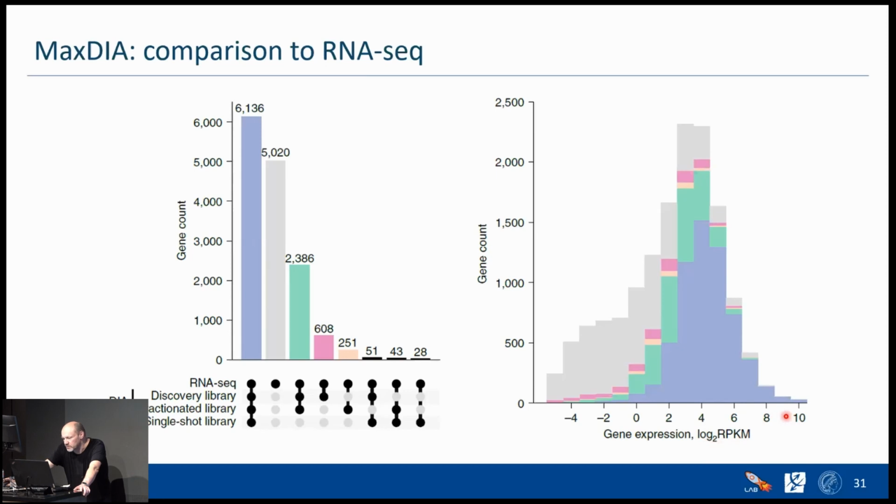And then what you see in the background, this gray stuff, you have to imagine this gray histogram is standing behind all of the other histograms. There we see the number of transcripts that are in each of these bins. We didn't use the cutoff. Often you cut off the RPKM at 0, because one thinks that there's no reason for the existence of the transcripts with a lower value. They are not really thought to be translated to proteins, or they are artifacts of the data analysis or any other reason why these are not translated to proteins, basically.